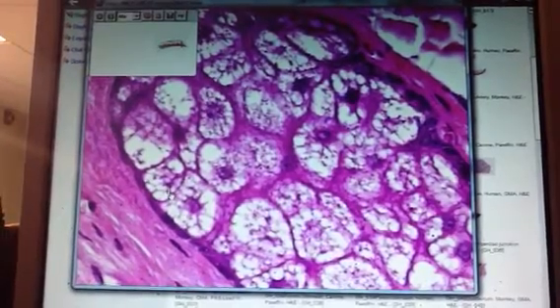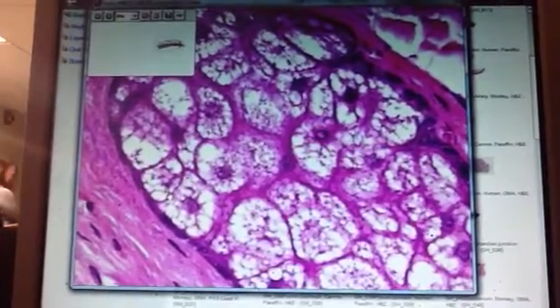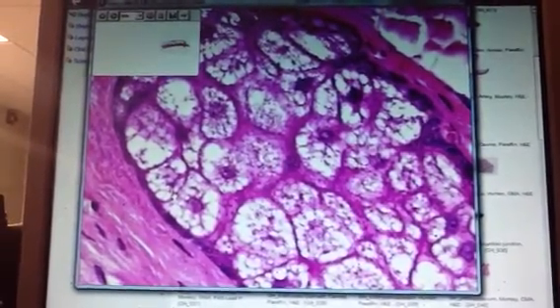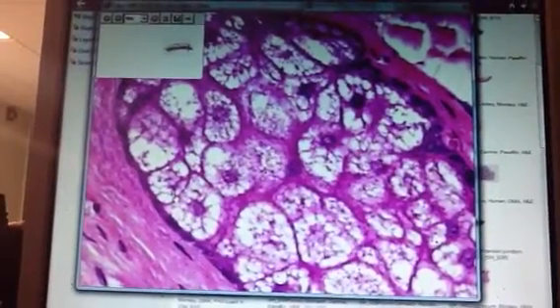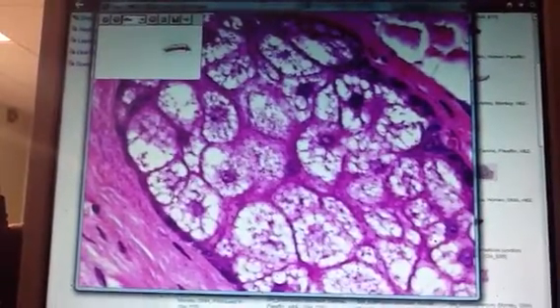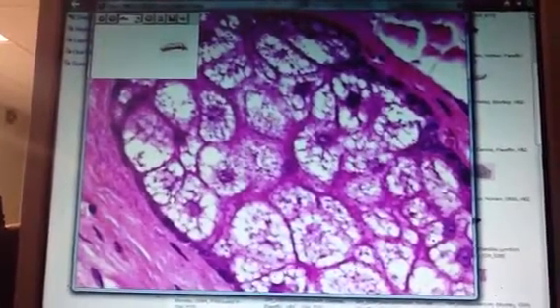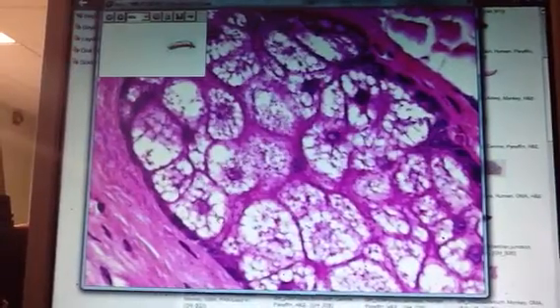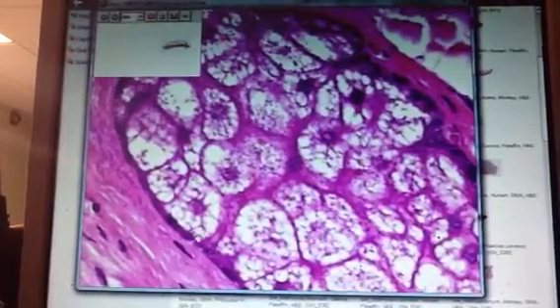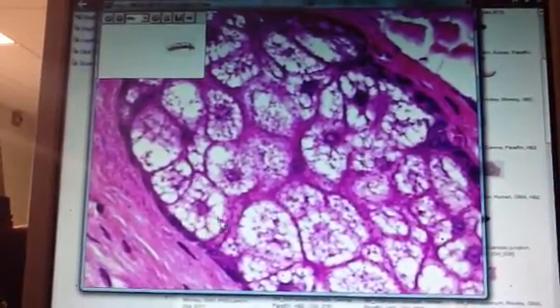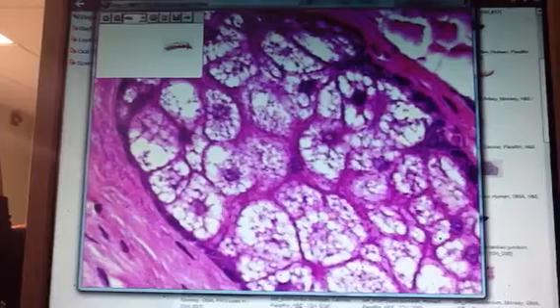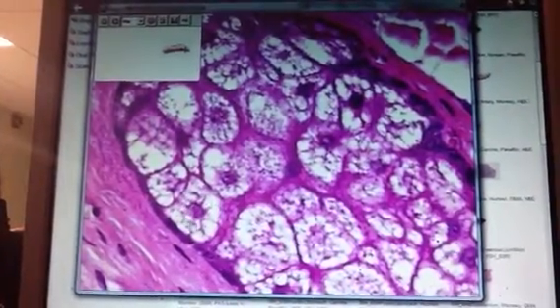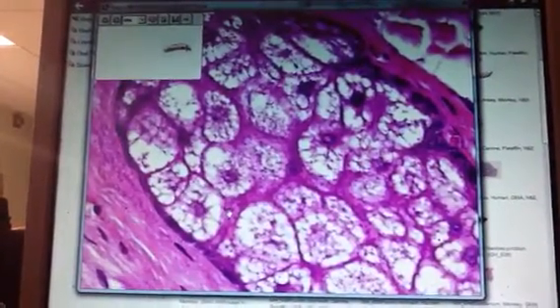Sebaceous glands secrete by what's called a holocrine method of secretion. The entire cell dies off, and the cell plus its product — this little oily product called sebum — gets secreted out. Each one of these little lipid droplets is part of that sebum. So what happens is these cells die off and get secreted out.